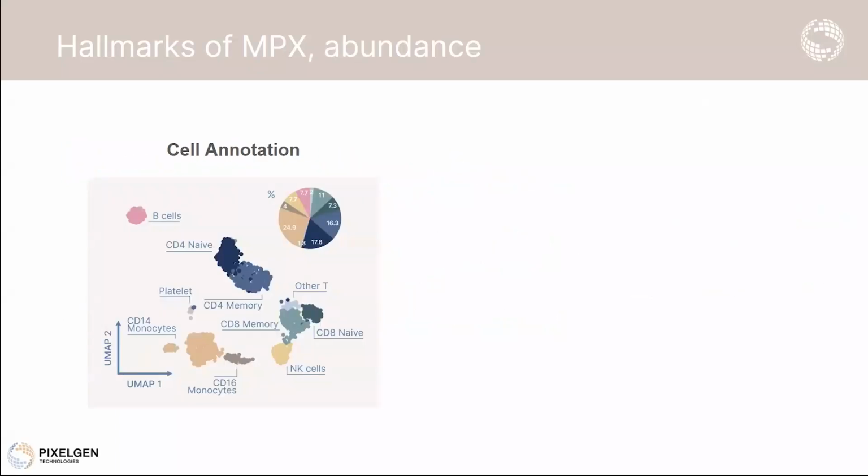And here you have kind of the same UMAP that I showed in the other slide, but here you can also see the annotations. So you can really do more of this deep phenotyping and also subdivide them, choose what cells you want to look at further for the analysis. Maybe you're just interested in a particular cell type.